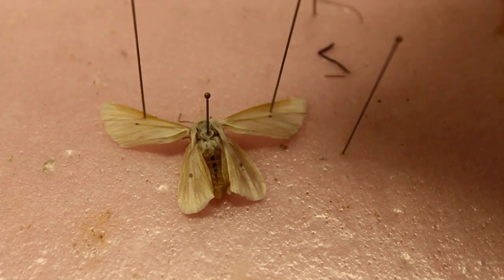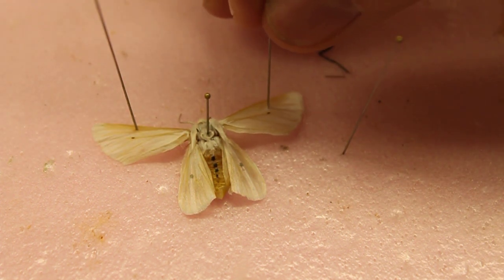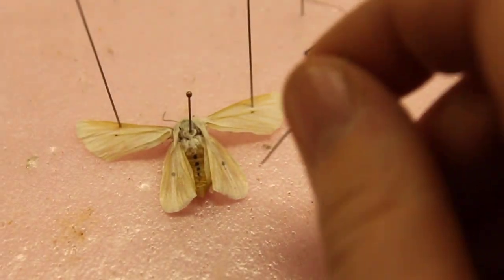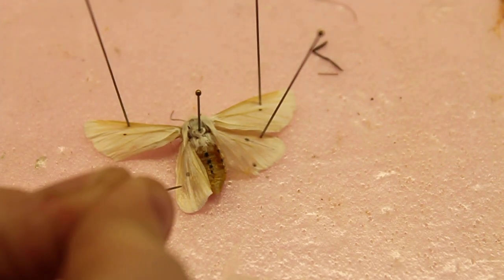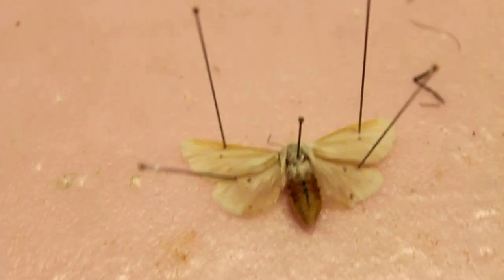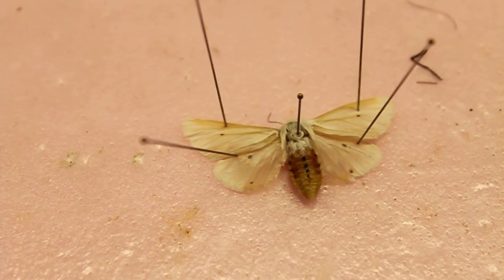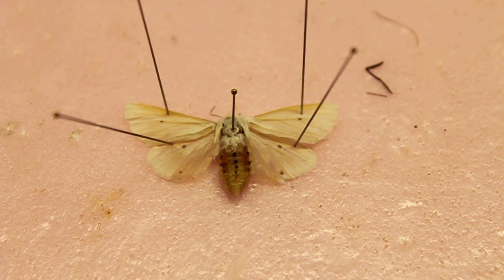I need to fix something — there we go. This is how you spread the wings. It looks like this, and you'll normally let it sit for about a week because it takes a while for the muscles and stuff in the wings to set.